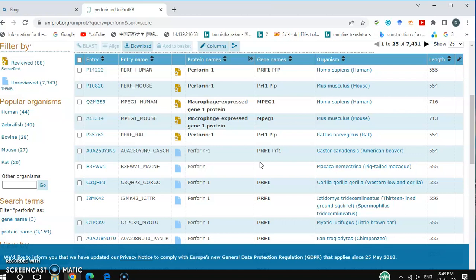And another reason is if your protein is a very long structure, a very big structure, and you no longer need the entire structure for your homology modeling or for docking purposes, you need only a very specific part of the structure. So you should focus on that part, and you can use that partial linear structure to construct your homology model by using Swiss model. So this is the number 3 reason. There are 3 different reasons that are very important for building the Swiss model.